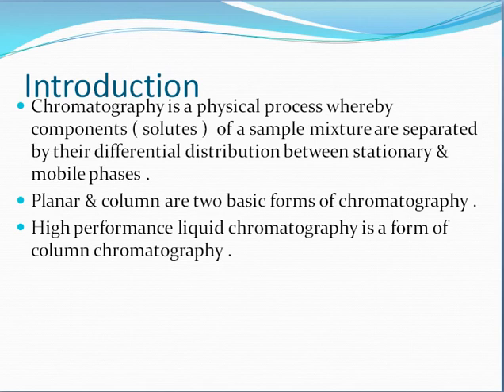Chromatography is a physical process whereby components, or solutes, of a sample mixture are separated by their differential distribution between the stationary phase and the mobile phase. There are two phases: one is the stationary phase and the other is the mobile phase. Planar and column are two basic forms of chromatography. High performance liquid chromatography is a form of column chromatography.